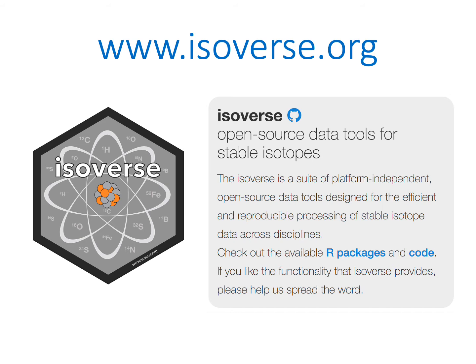And that's where we started creating a number of tools that all are now collected under this umbrella of the isoverse, a broad umbrella organization for open source data tools that are useful in the world of stable isotope geochemistry and all the other scientific disciplines that make use of stable isotopes.